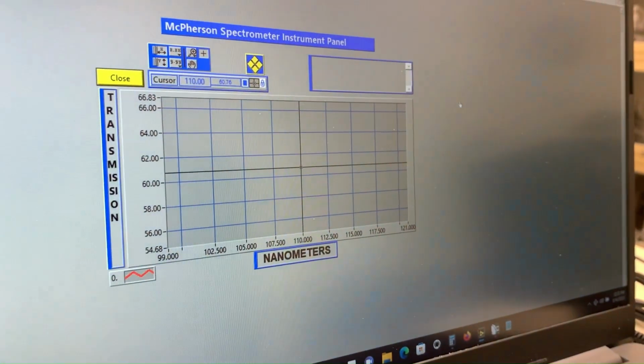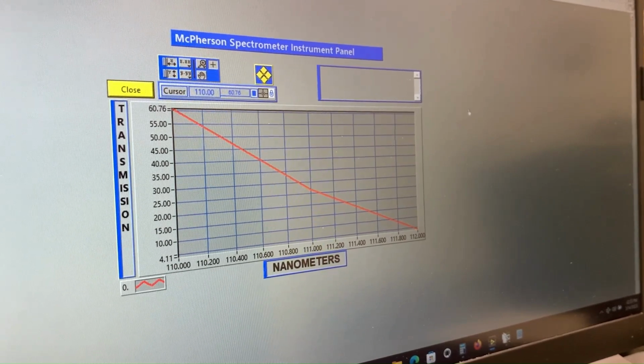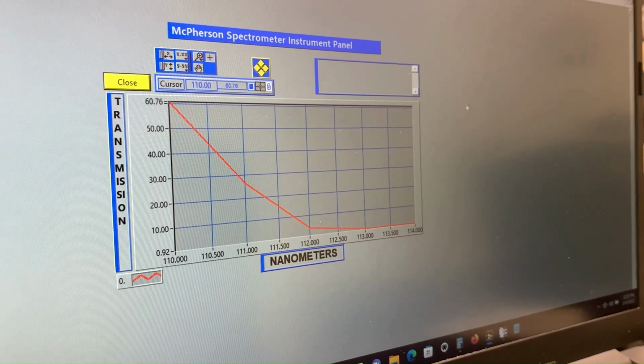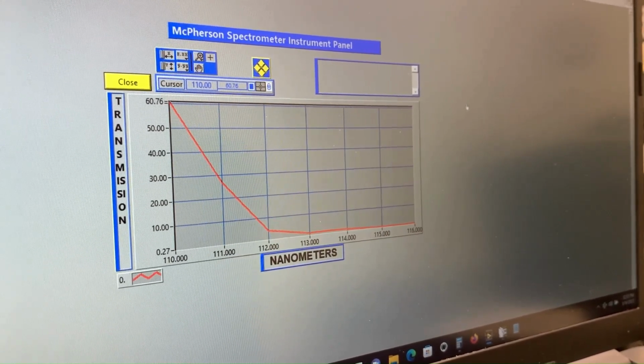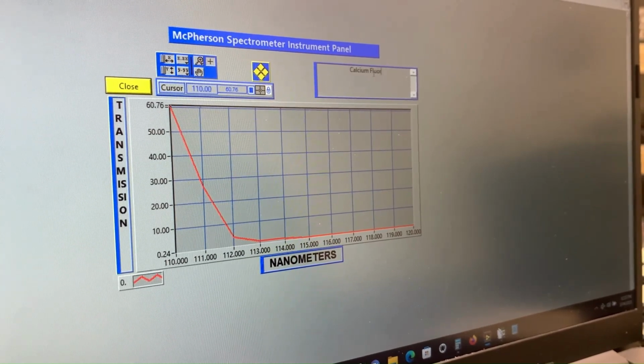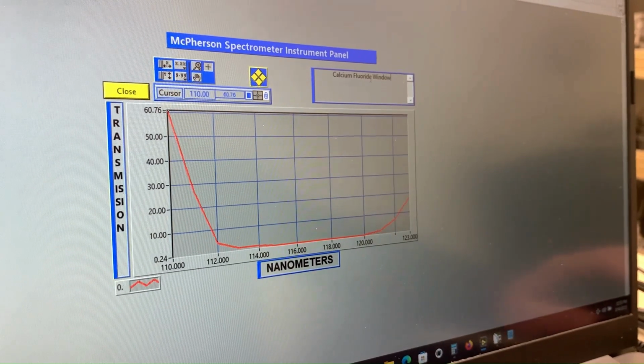Once the data acquisition process has begun, you have data point 110, data point 111. You can cancel without losing position. So if you think you wanted to start over, be a little bit patient and don't hit cancel until data acquisition has begun. I can make notes that will get recorded with the data.